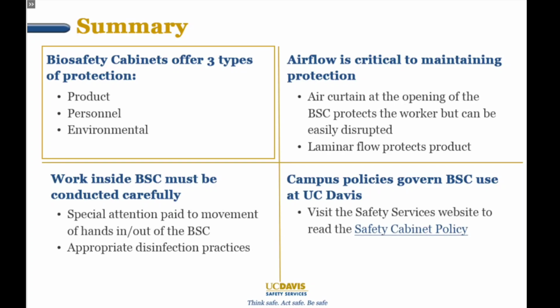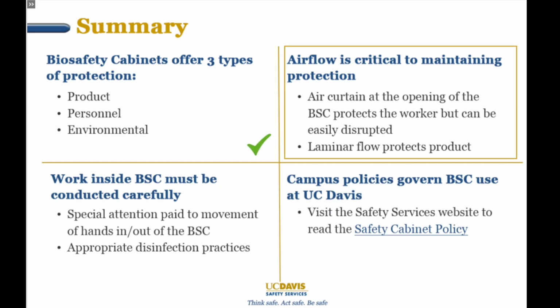In summary, biological safety cabinets offer product, personnel, and environmental protection. In order to consistently offer these protections, the BSC must be used properly, which hinges on maintaining appropriate airflow. We learned that the air curtain at the opening of the BSC protects the worker, but can easily be disrupted. The downflow of air provides product protection.